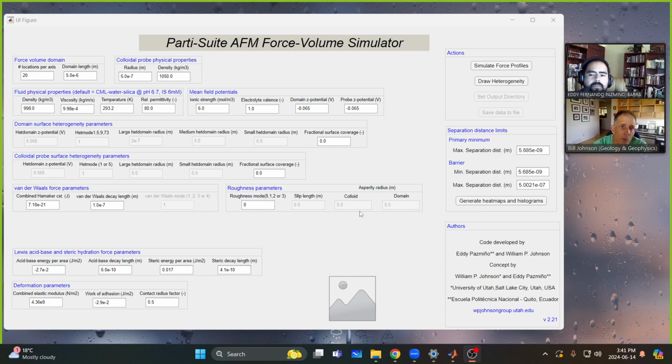Eddie has the Parti-Suite module open for this. It's called the AFM Force Volume Simulator. Eddie, why don't you say a few words about it? Yeah. So the installer, and I think we're going to include this video as part of the how-to-use-it. It's also going to be represented at Bill's website, William P. Johnson's research website.